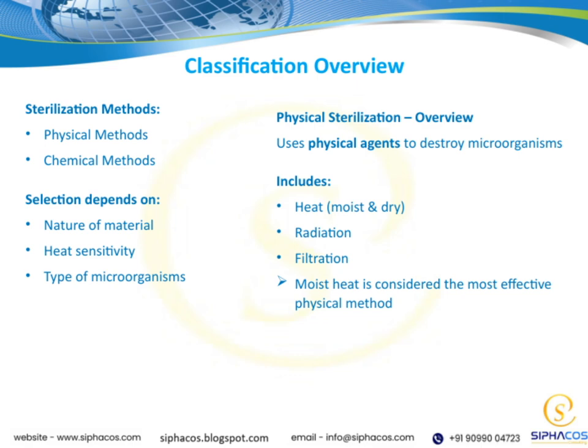Now, when we talk about sterilization methods, they can be broadly classified into physical methods and chemical methods. Each has its own applications depending on specific needs. Choosing the right sterilization method depends on several factors. For example, the nature of the material you're sterilizing is crucial. Some materials can withstand heat, others can't.